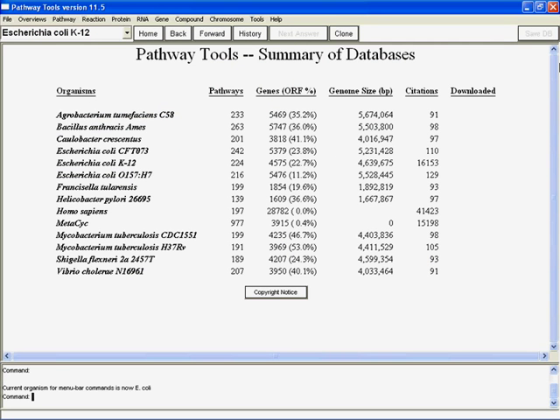Okay, so here we are. I have Pathway Tools version 11.5. Keep in mind that if it's been a while since this webinar was made and you're looking at it, you may have a more recent version with additional capabilities.